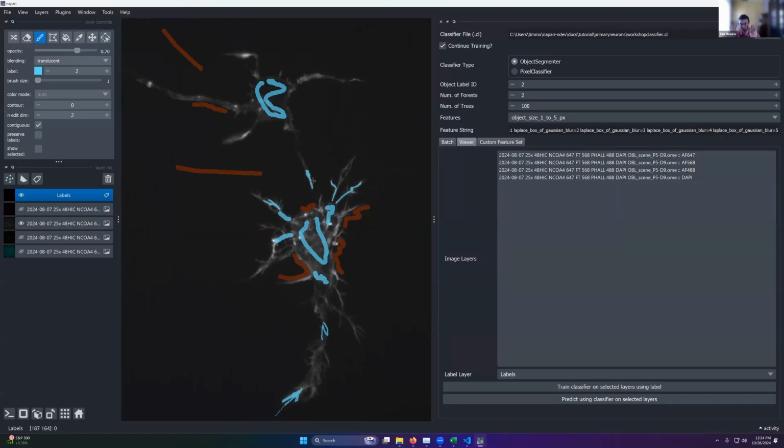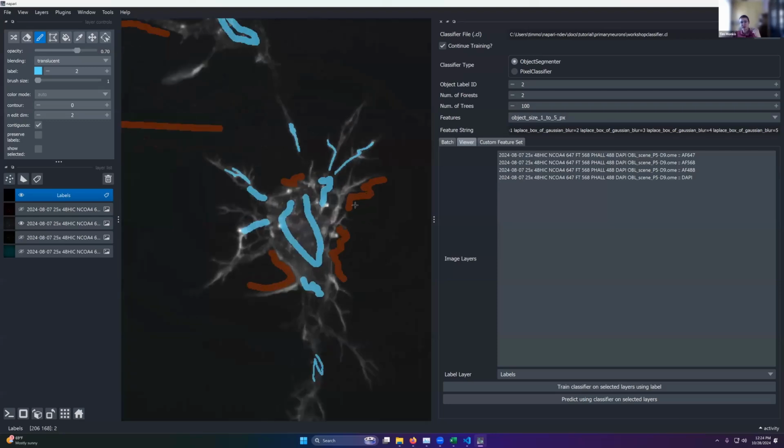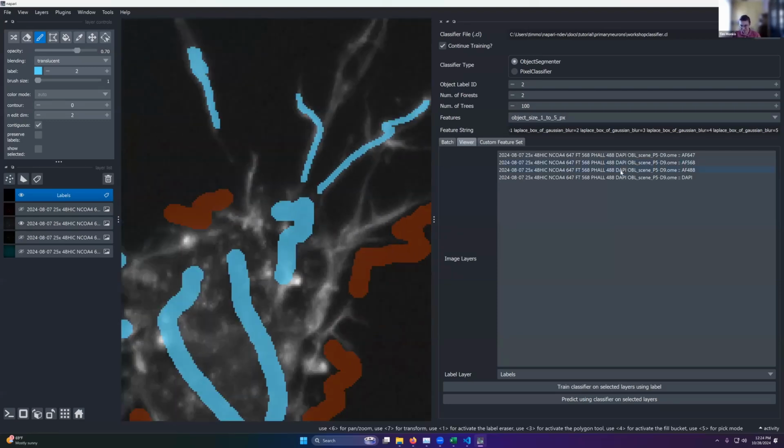We use this on axons. We've used this on something that looks like cheesecloth to me, like lung tissue. We've used it on retinas. Lots of different sites, from a mesoscale structure like veins going through an eye, to these small scale structures, because everything is about what the scale is that you're looking at relative to the number of pixels it has. And this has a width of about 8 pixels. The channel that has phalloidin is 488.